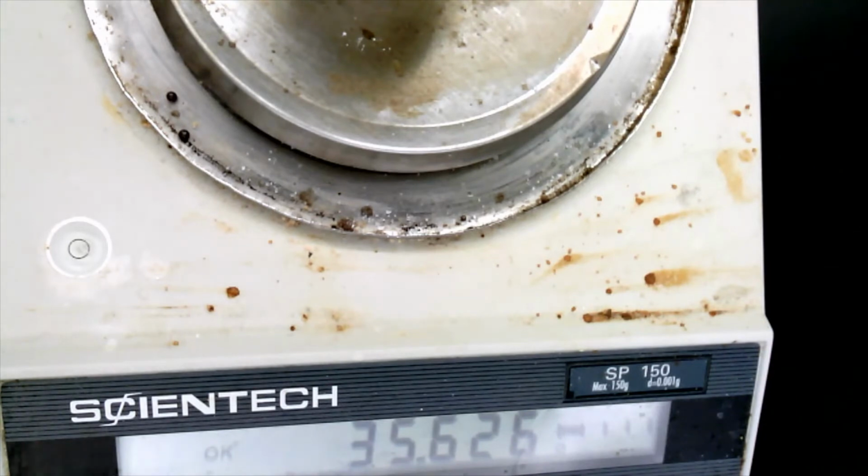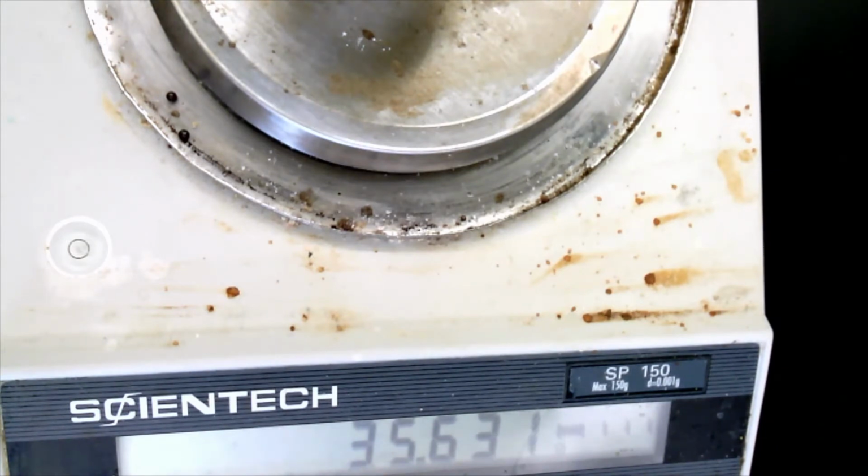And then just like last time, we can find the mass of the piece of magnesium because we know the mass of the container it's in. Okay, the empty container, that's the first thing we measured. Now we have the mass of the container plus the magnesium. So let's go ahead and transfer this over and get this reacting. Well, if it's going to stabilize, it's going to stabilize for us.